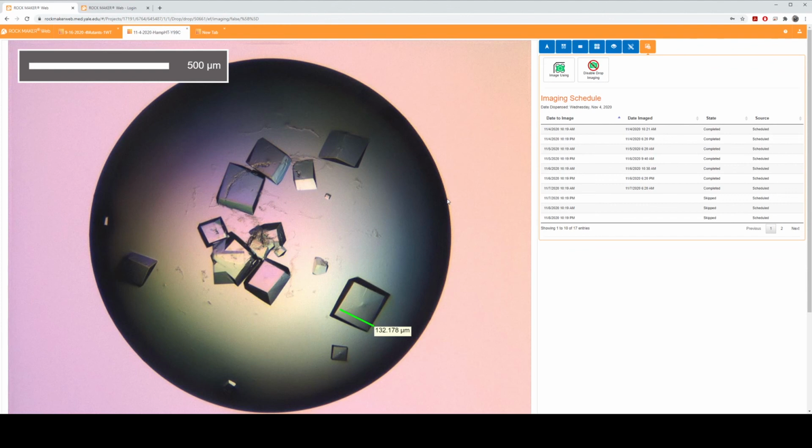So what Rockmaker Web cannot do remotely is design new experiments and create barcodes and work with the ISO design wizard. Of course, we can make accommodations for that through TeamViewer in certain cases, considering the importance of remote work.